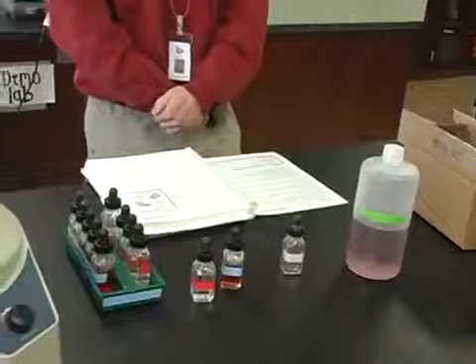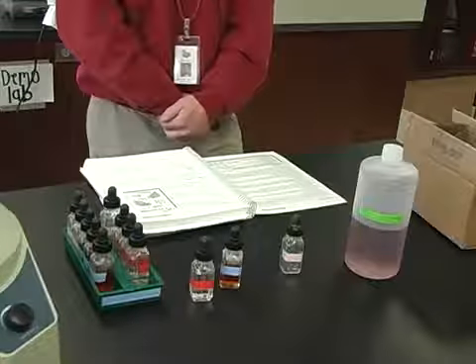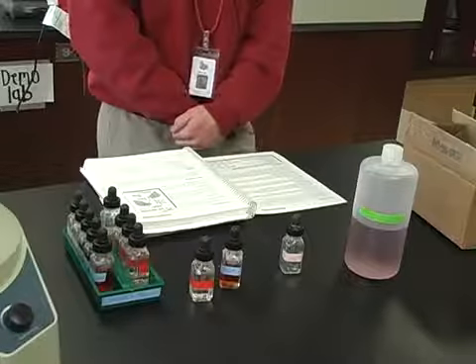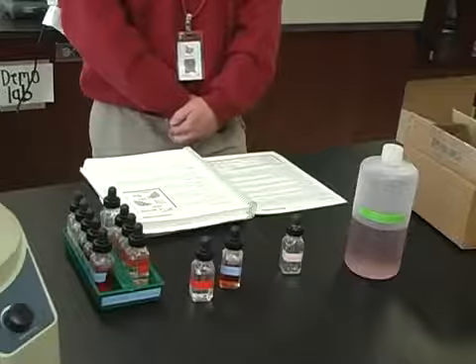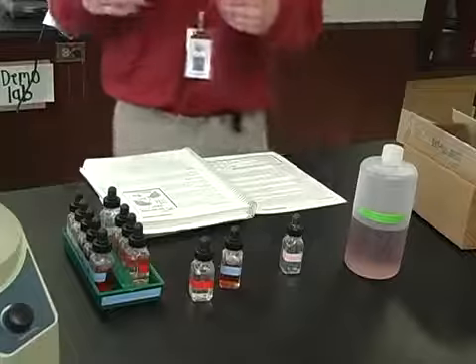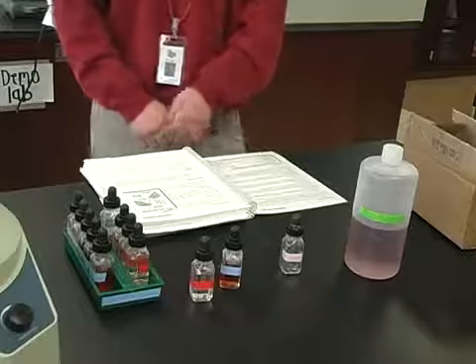Measuring solutions. Generally, you should estimate the volume of the solution that you add. Notice it said estimate. It's not necessary to use a graduated cylinder to measure the solution volumes. You might wish to calibrate a test tube in milliliters just to give yourself an idea of what a volume of a milliliter actually is. You may also want to count the number of drops in a milliliter. The general rule of thumb for these droppers is 20 drops is about a milliliter. But they usually just tell you to add 2 or 3 drops. And since the name of this lab is called qualitative analysis, not quantitative analysis, what you really want to know is what is actually in the solution, not how much is in the solution.